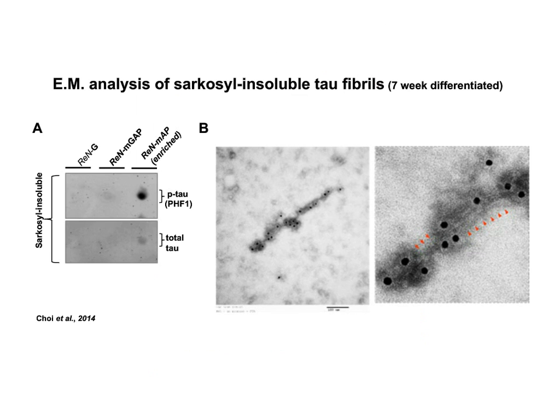And then we turned to immuno-EM, because one of the decisive pieces of evidence for tau fibers is to show the structures using electron microscopy. From the insoluble fractions, we actually went to the EM studies with the antibody against tau. On the right side, B, you can see those black dots. That's the tau 46 antibody, which recognizes tau protein. And if you look at these filament-like structures, you can appreciate that inside there are filament-like structures matching the size of tau filaments previously reported.